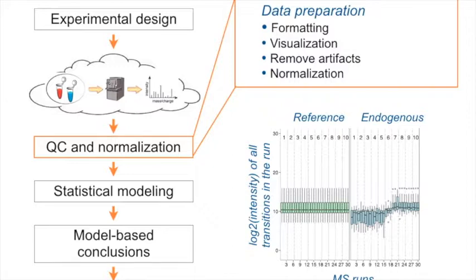We actually had a situation recently where, so I don't know if you know, IRT peptides are used to calibrate retention time because they appear in specific places in chromatography, and so that's their primary use. Now, you can have a secondary use of them by equalizing the intensities. So they're not used in the retention time space, but in the intensity space, provided that you spike them in the same concentration in every run.